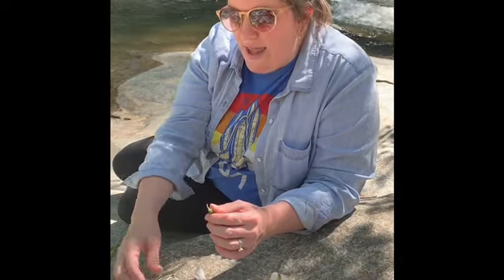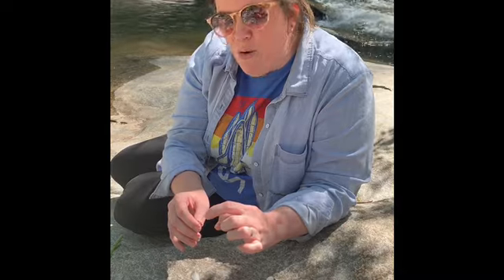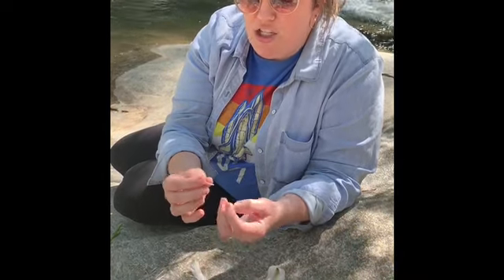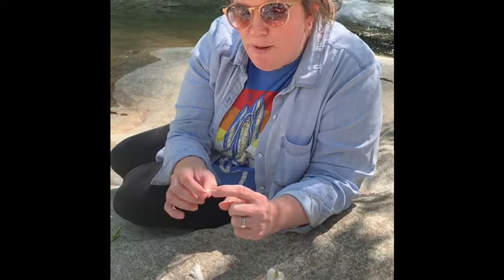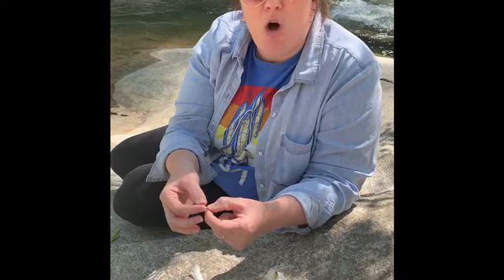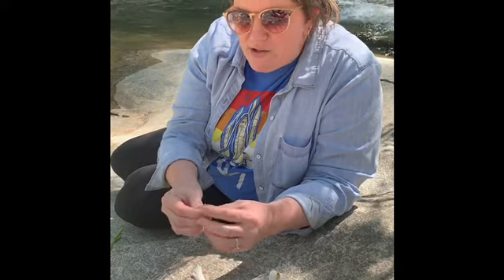So the pollen gets on the male part, which is the anther, and as the wind blows, the anther brushes up against this part right here, and so pollen goes down almost like a straw into this tube. So this end piece, again, is the stigma, and it's connected to this longer piece, which is the style. Alright, so you have the stigma, which is this end piece that has this opening to it. And then you have the style, which is that straw piece. It's kind of like a stalk where the pollen goes through, and it goes down to the end.